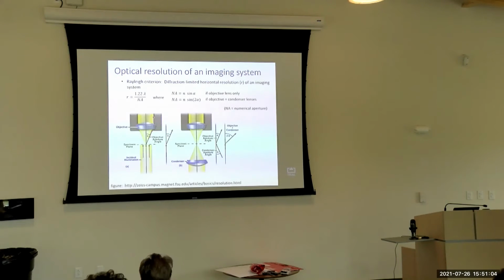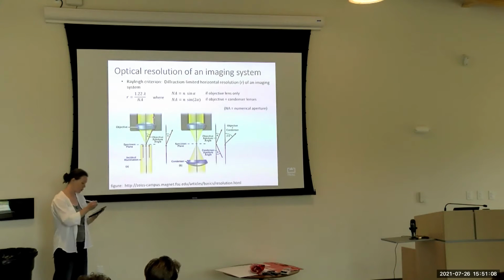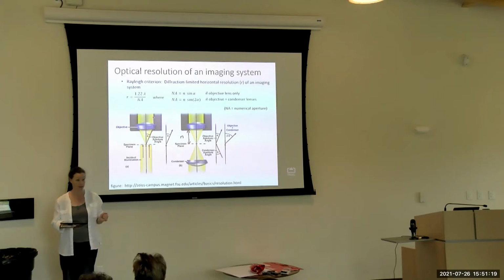Is the index of refraction that of the particle that you're trying to resolve, or the medium? No, it is the index of refraction in this distance here. So it's that of the medium between the specimen and the objective lens.